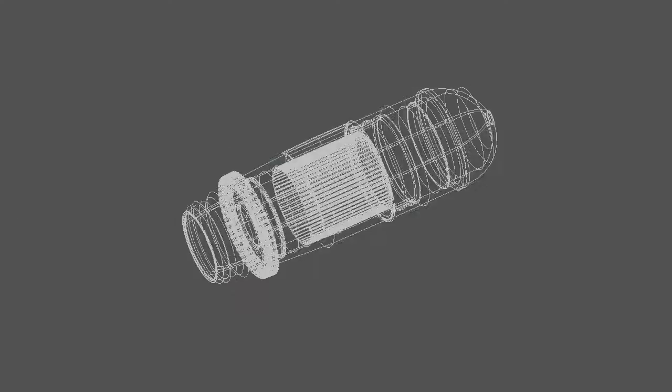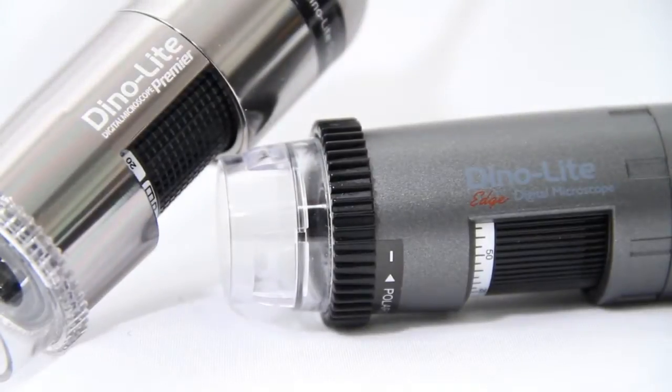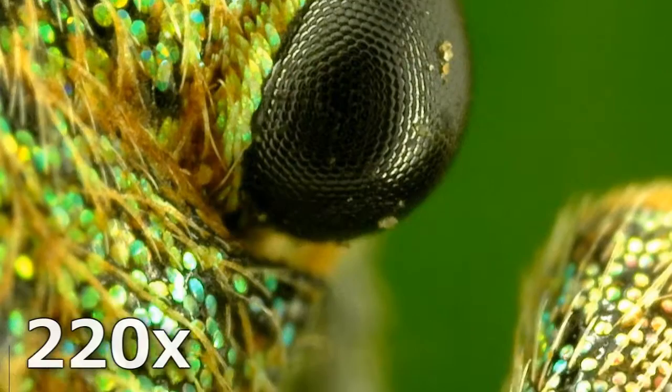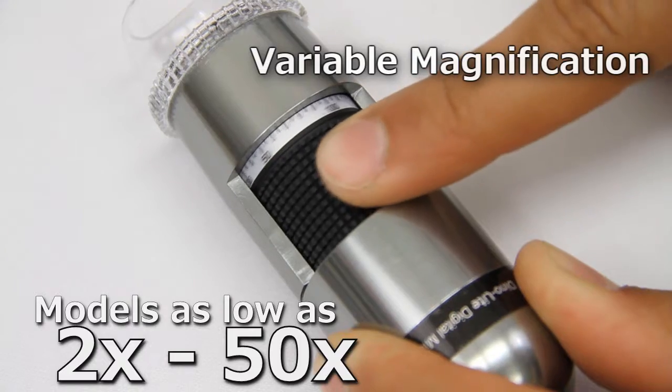Over the past decade, the DinoLite microscope has rapidly expanded in use and capability, bringing easy-to-use, affordable, high-quality microscope devices and software to a wide range of applications and users. Most DinoLite models have a standard magnification range of 10 to over 200 times, with high magnification models reaching up to 950 times.